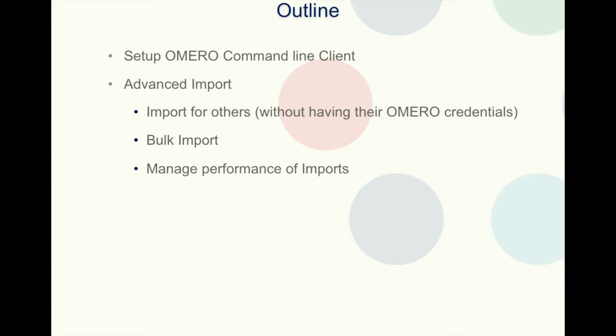In this short video snippet, what we'll be looking at is how to set up the OMERO command line client and eventually how to do some advanced import commands using the OMERO command line client to import images into the OMERO server.